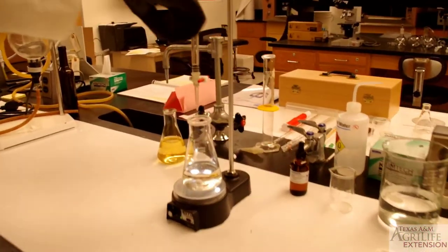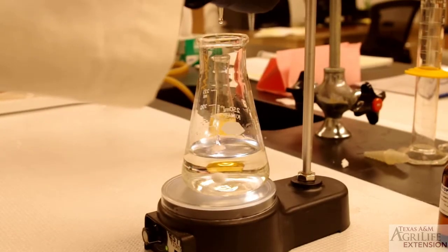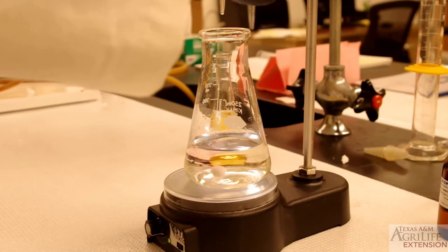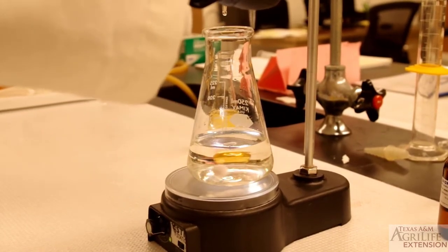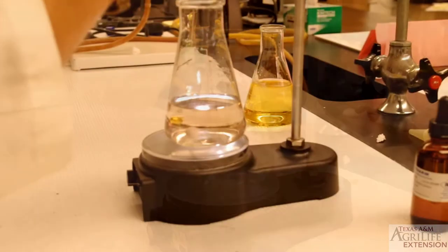Notice that we are using a stir plate and a stir bar, but samples can be run without them by simply using manual agitation. Start the titration by gently opening the stopcock and letting the sodium hydroxide solution drop in your sample flask.